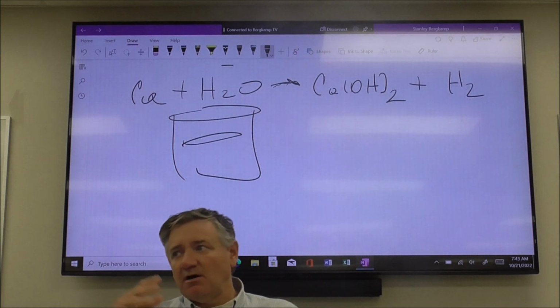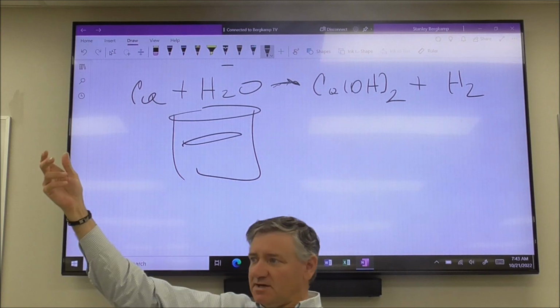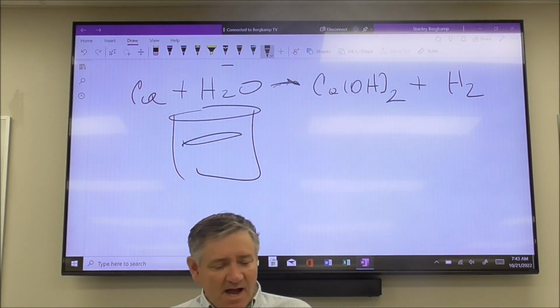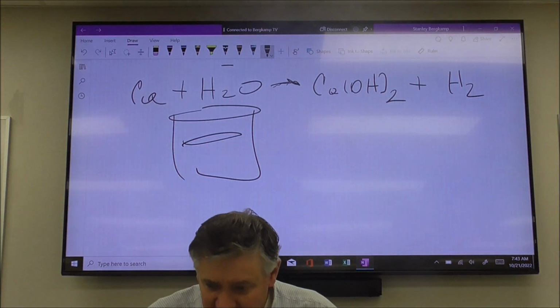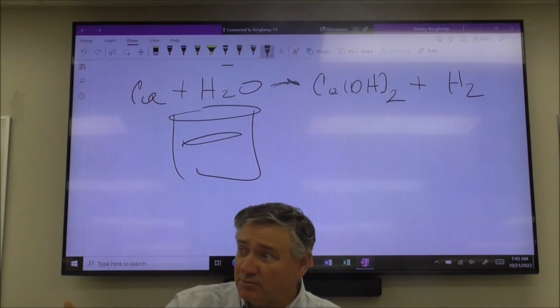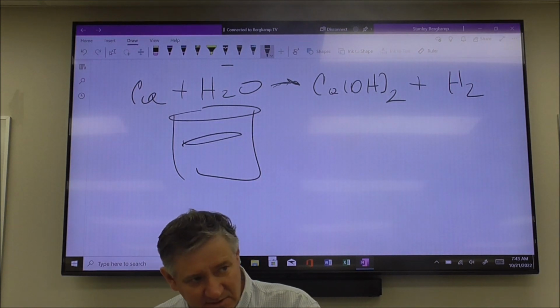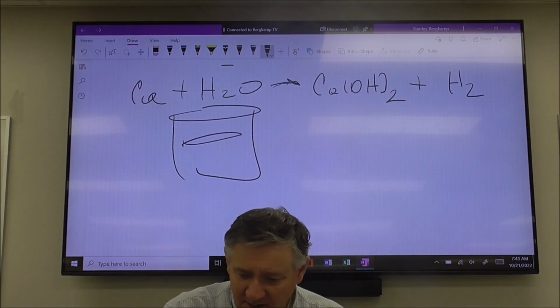You all saw all these bubbles form, and some of you had them overflow the top of the test tube. Out of this, and some of you can attest to this, you also got a tremendous amount of heat. That test tube got really, really hot.